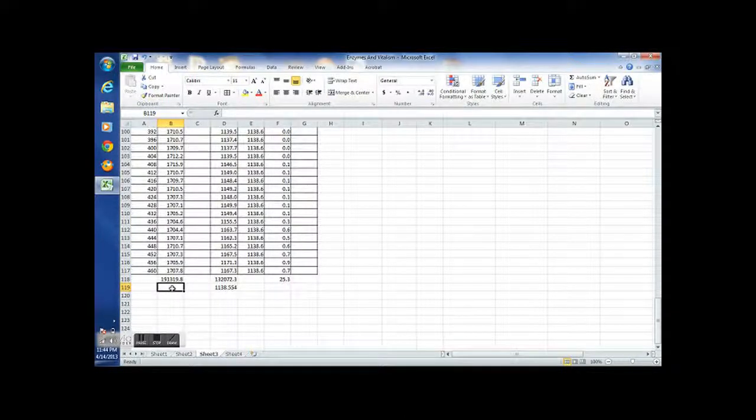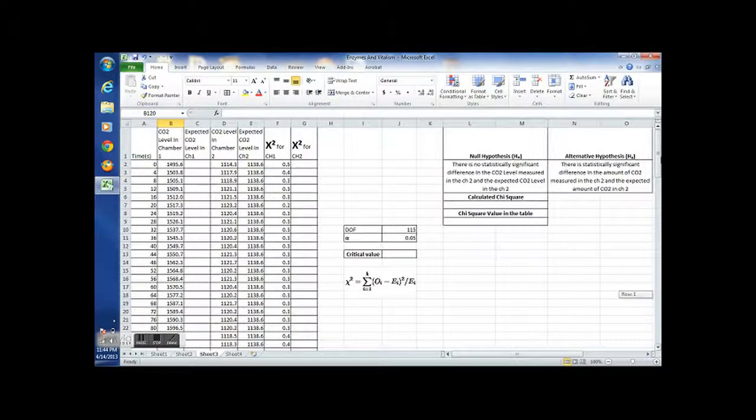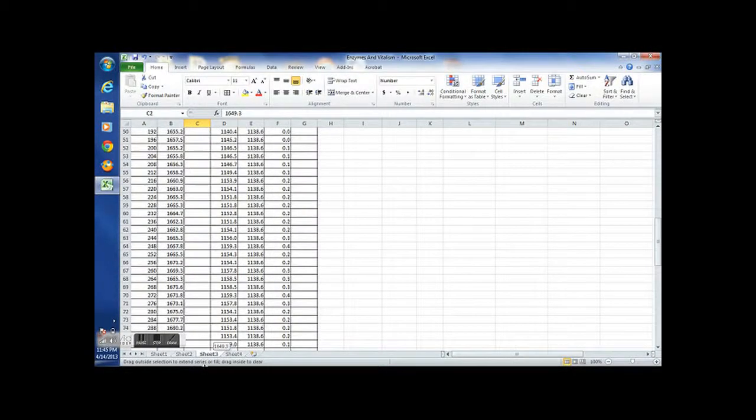The average is this number divided by 116. This is, I will say, 1649.3. Alright, this is my expected value. Drag it down.